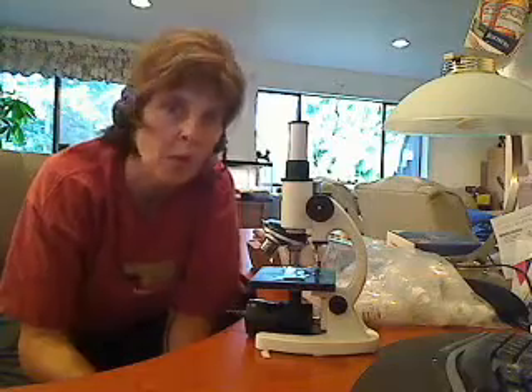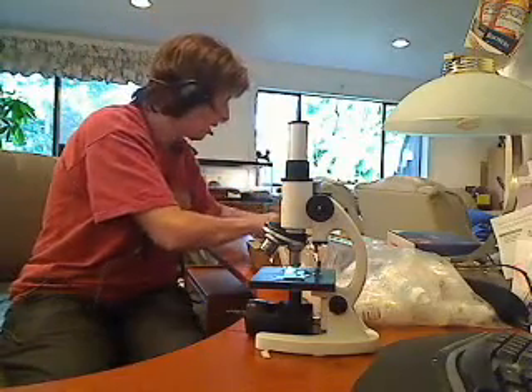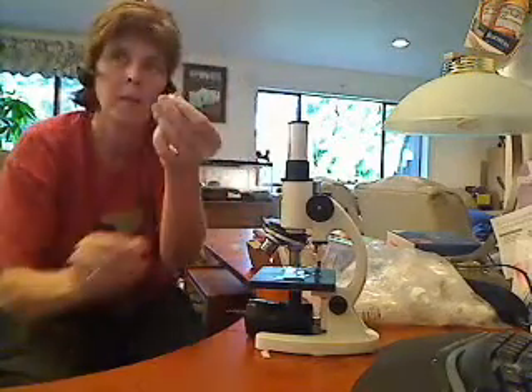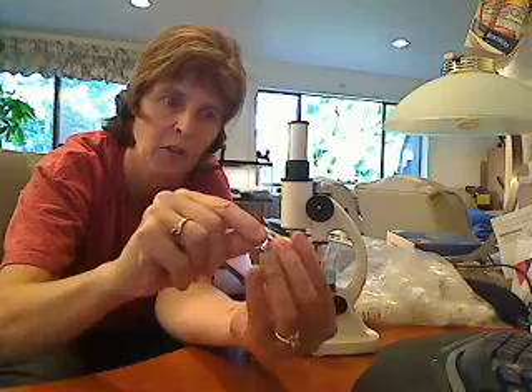You're going to start with a normal household onion. It doesn't matter what color — I chose a yellow one. You're going to cut a little piece about that size. Then you're going to peel the inside, not the outside, but the inside curve.